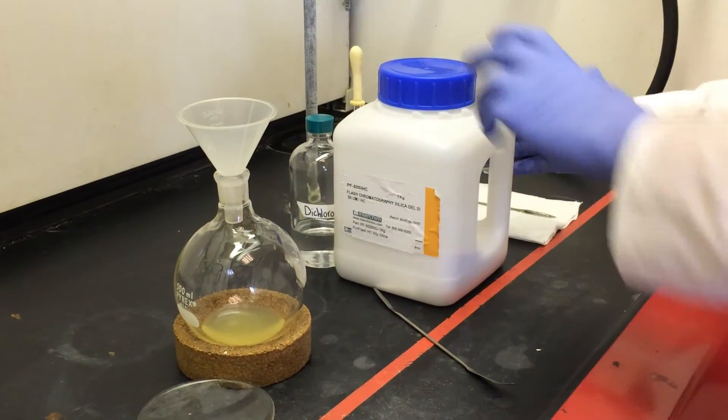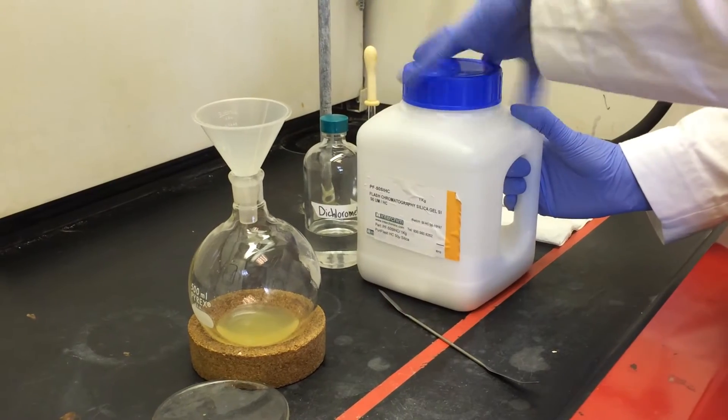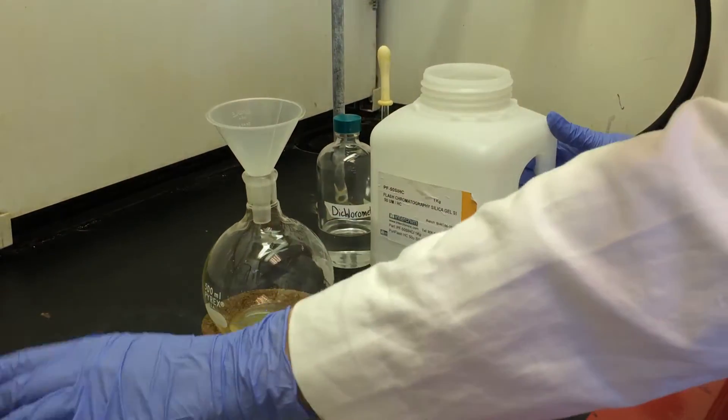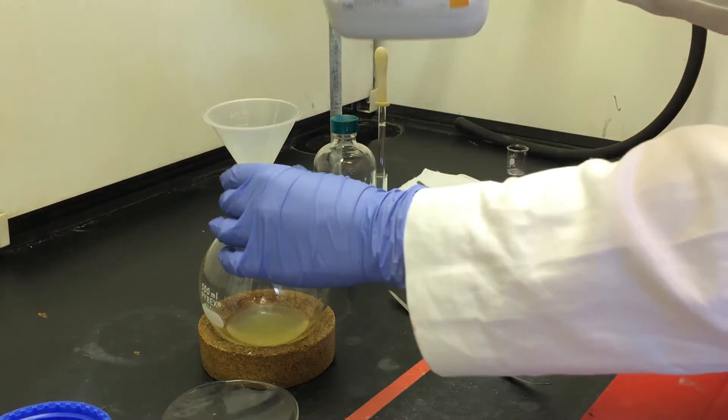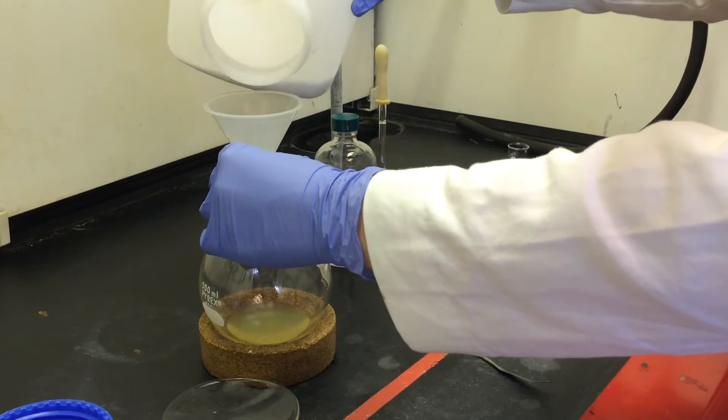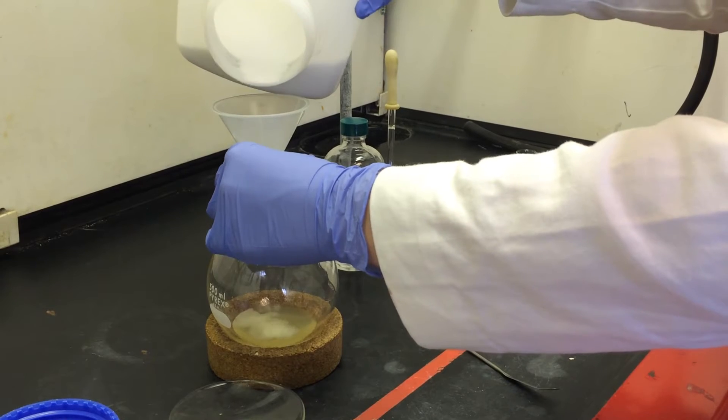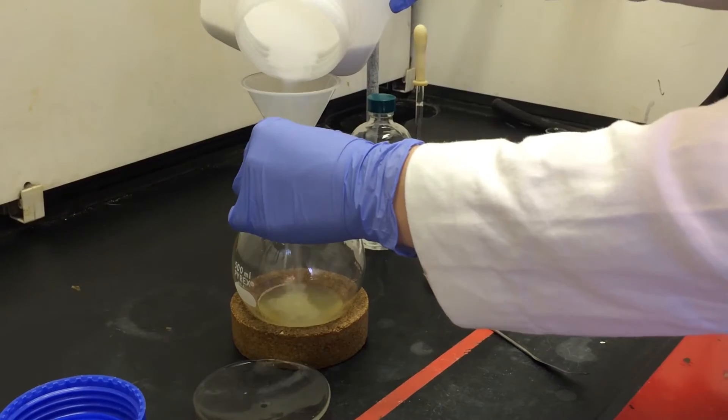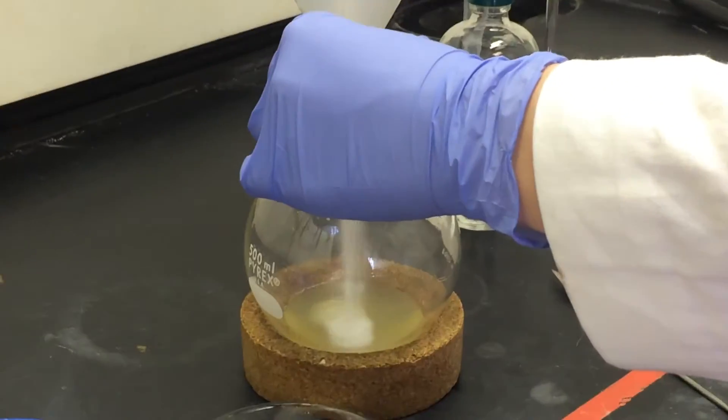When your sample is all dissolved in the dichloromethane, next you add a little bit of silica gel. Make sure you do this in the hood. You do not want to be breathing silica gel. You only want a small amount in your sample. It'll start to look sort of like a slush.